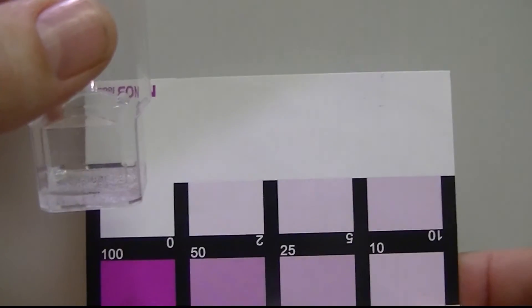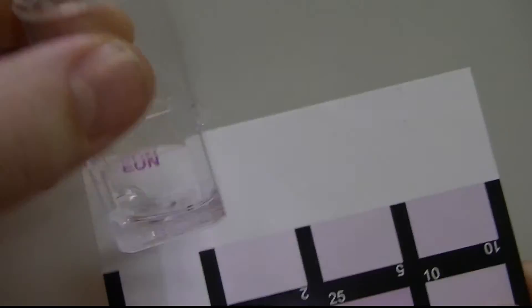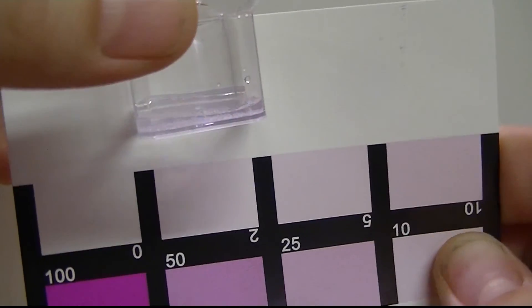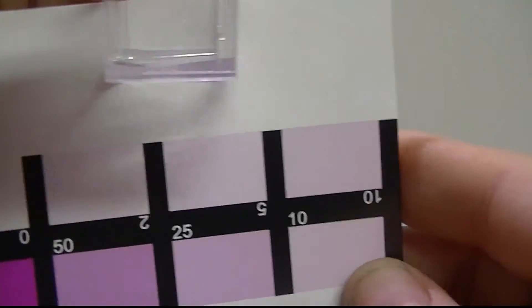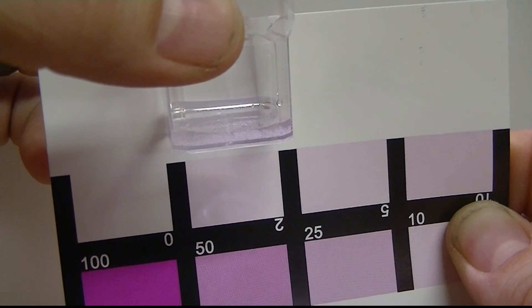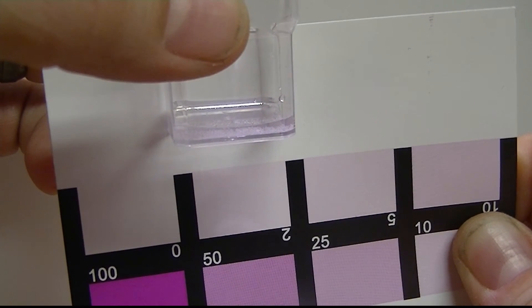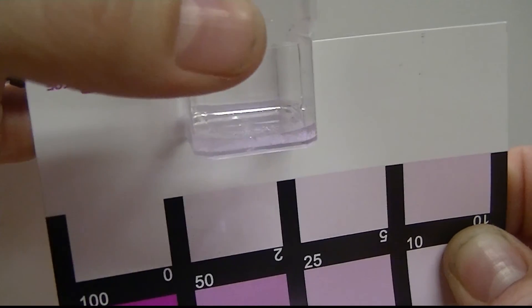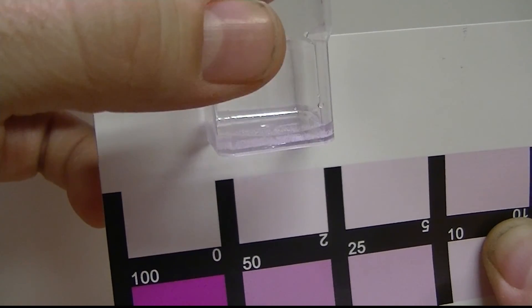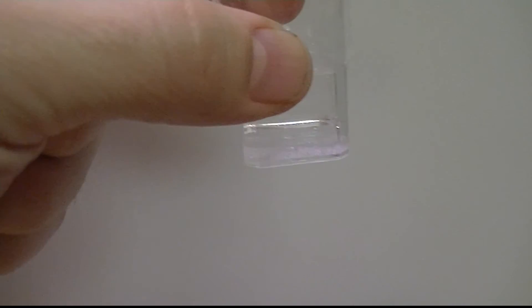Alright guys, so the test is finished after the three minutes. Looking from the top down it just looks like clear water, and actually looking from the side — I'm sure this camera is not going to want to pick it up — but it's still almost clear, it's slightly pink. After looking at it, I'm still right on the two, which you divide that number by ten when you're doing the low range kit, and that's going to tell me I'm right at 0.2 — somewhere between 0.2 and 0.5. So I'm not clear at zero, but I'm just right down there where I want to be. You can see a little bit of pinkness to it when I'm holding it up against this white board.